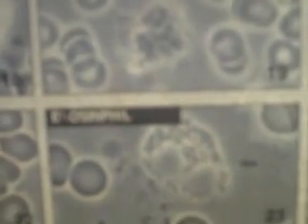Here we have the eosinophils, again a white blood cell. Here we've got the basophils. They're generally a light blue under the dark field, and they're generally brought on as a histamine reaction, generally related to either allergies or an allergy to an environmental toxin. Lymphocytes over here. I can't even see them in there.